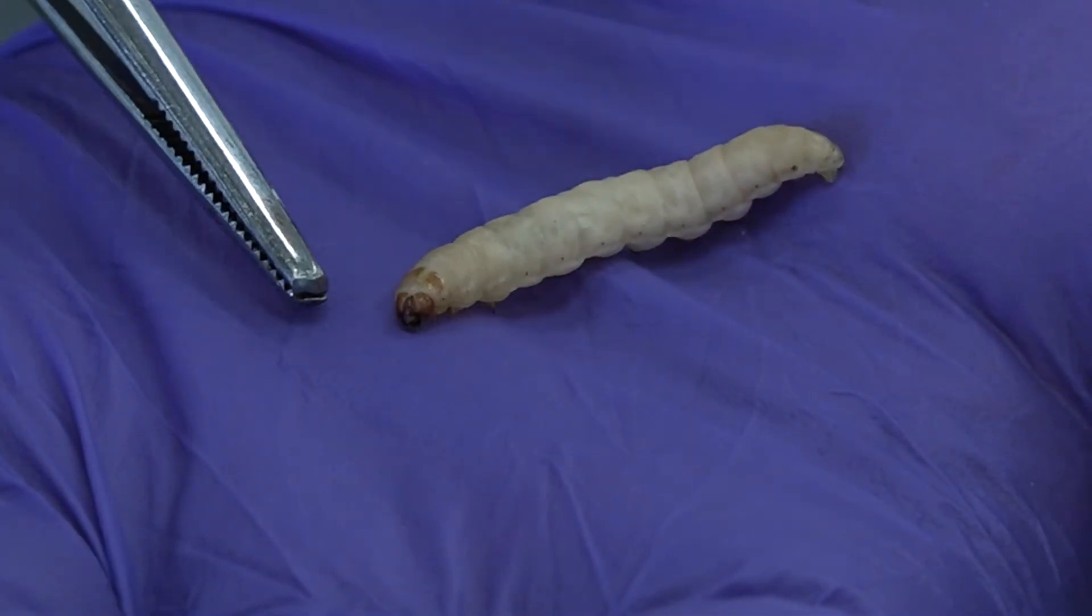Larvae have a head end and a tail end and we inject into a proleg.